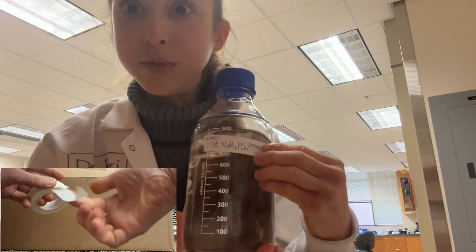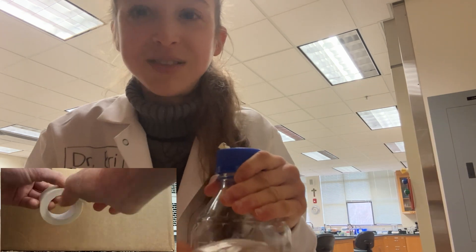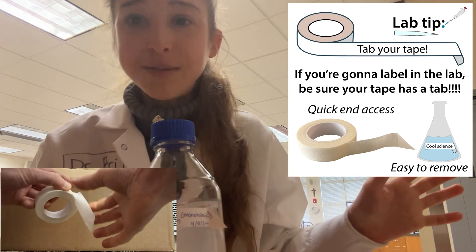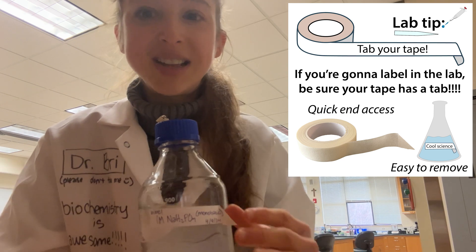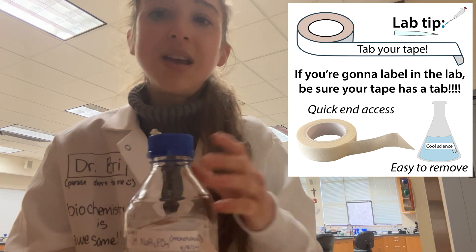And now when you go to clean up your bottle, you'll be able to pull that tape off easily. I have spent way too long trying to tease off little bits stuck onto bottles — just keeping tabs on things makes things so much easier. You can always use acetone or rubbing alcohol to get it off, but you don't want to be using all those solvents if you don't need to. So just keep a tab and life's good.